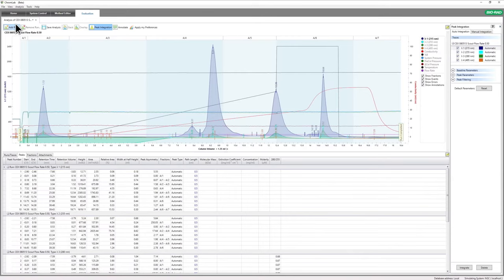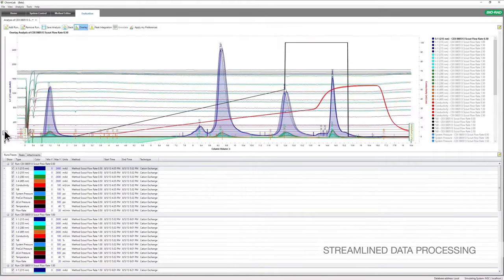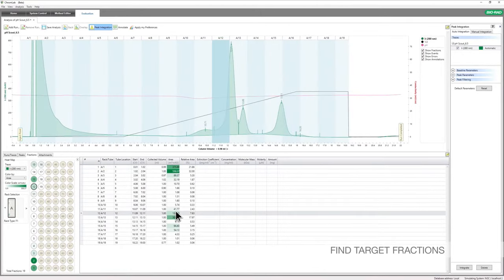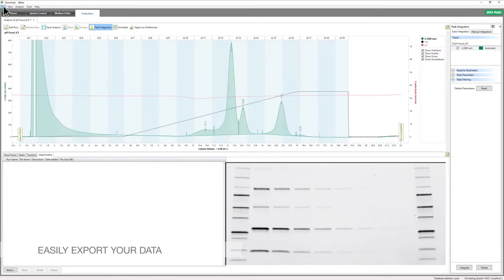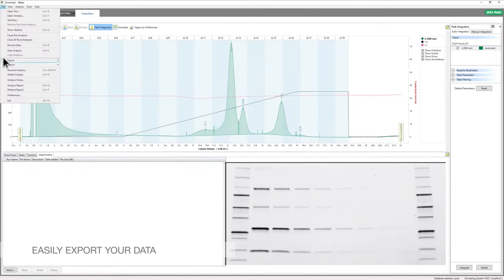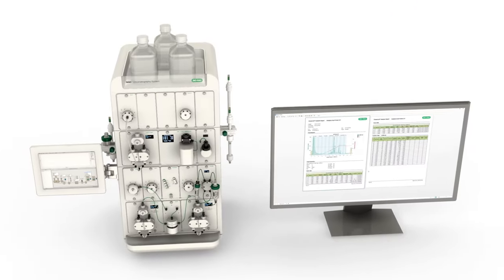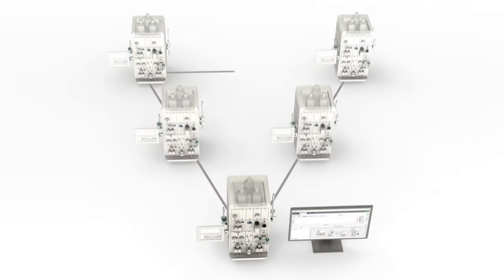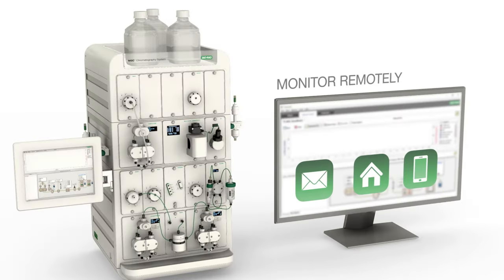Data processing is also streamlined with single-click peak integration and customized views. Confidently identify and locate fractions containing proteins of interest with fraction heat maps. Document all relevant data and details of your method and analysis in an easily exported report. Save space in the lab by controlling multiple instruments from a single computer, or monitor your system remotely.